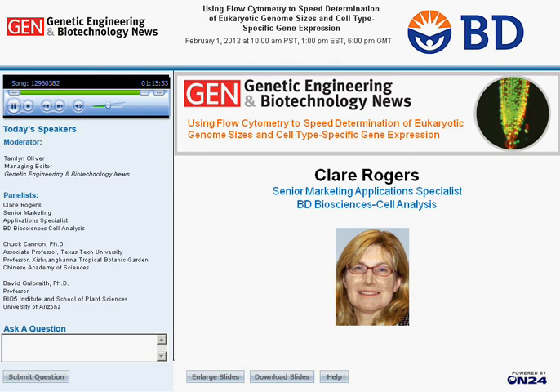So a 60-micron protoplast flowing through the system would not be a problem. It would only be a problem if light scatter signals needed to be on scale. Those would undoubtedly be off scale on the standard C6.